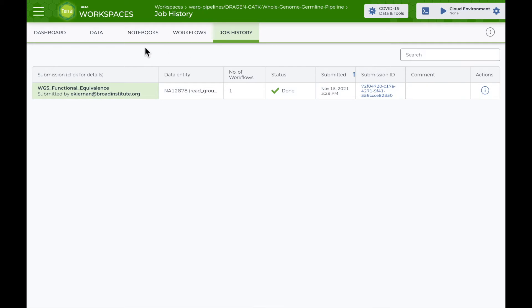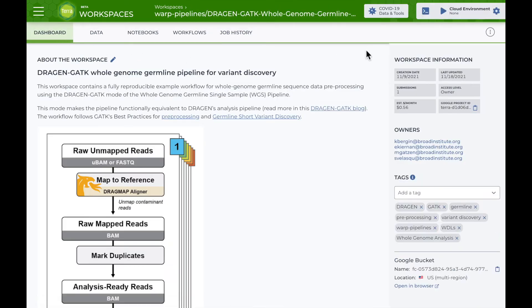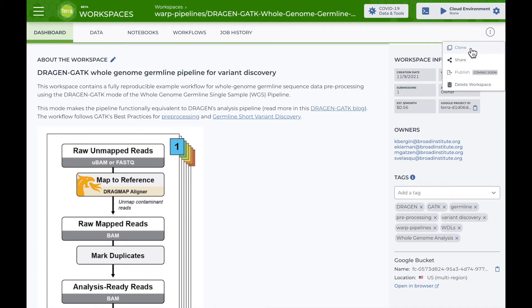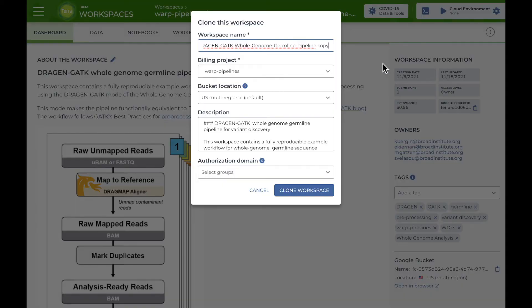So what if I actually want to run this workflow? First, I need to clone the workspace by selecting the vertical three-dot icon from the dashboard and selecting clone. I'll give my new workspace a unique name and select a billing project. Then I can select clone workspace.